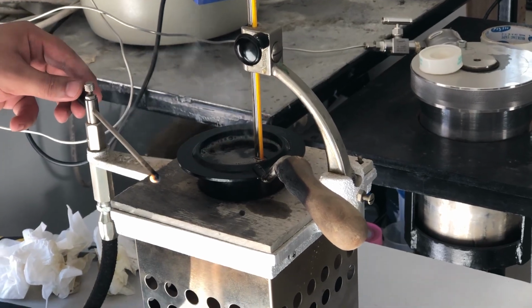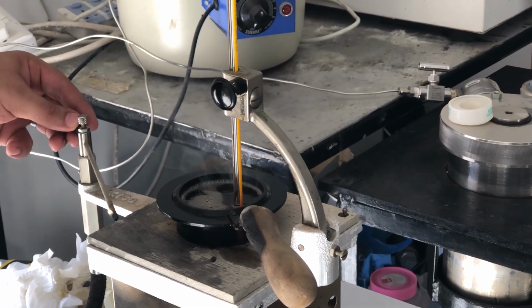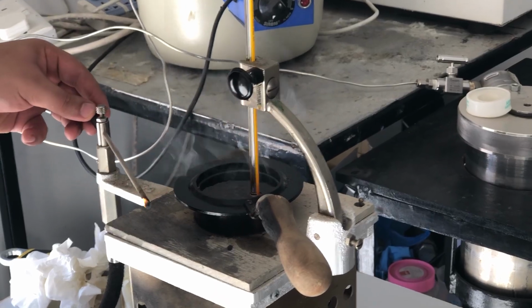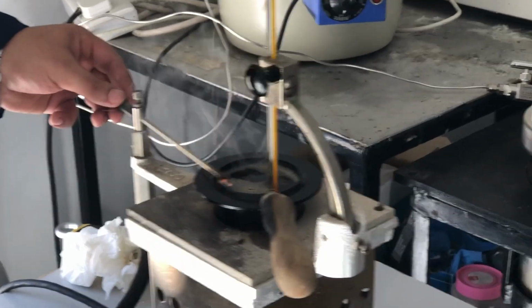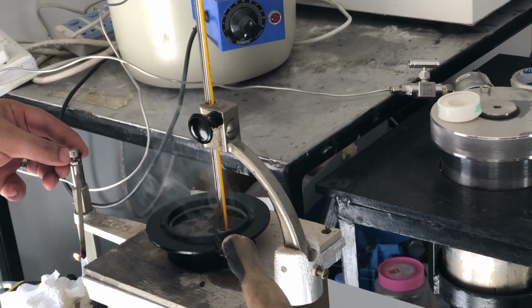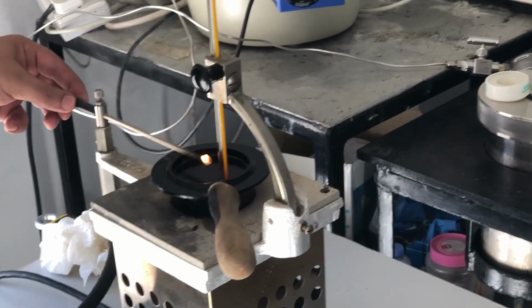Now the temperature keeps increasing. See, several flashes are coming, but still no fire.